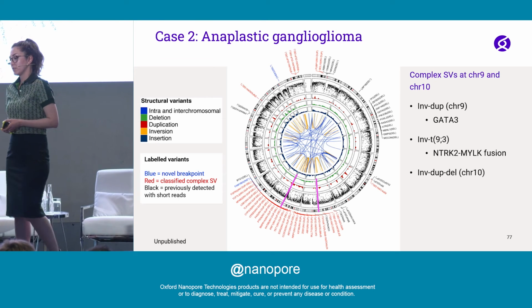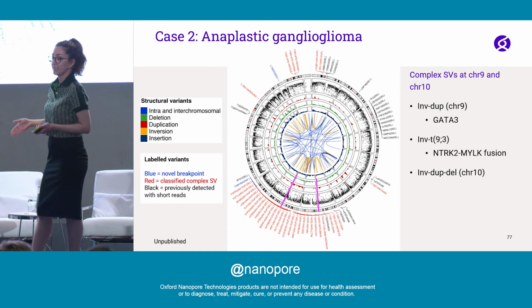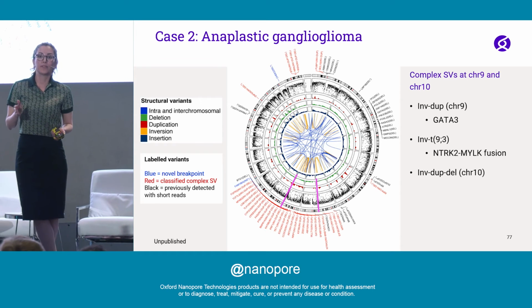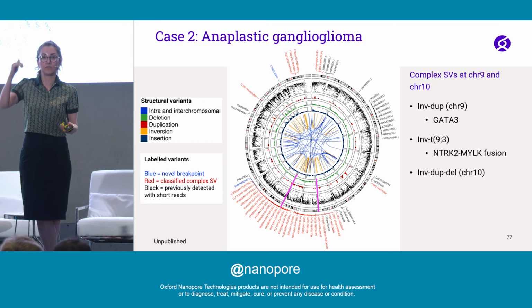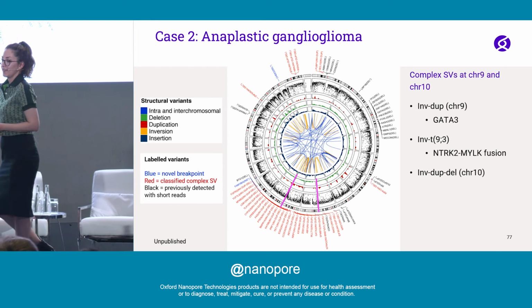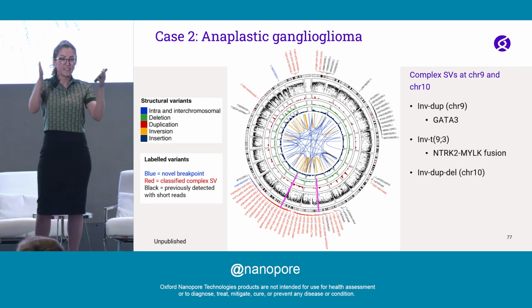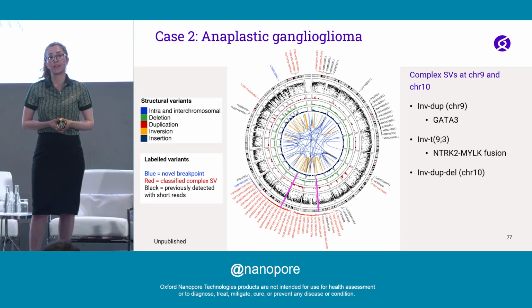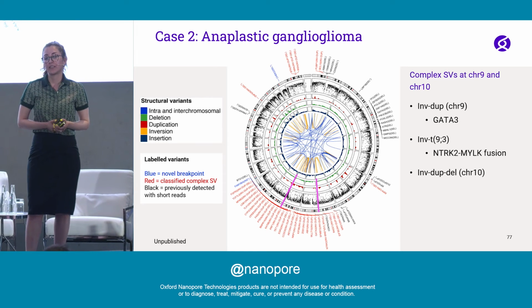In terms of chromosome 10, we identified many inverted duplicated deletions, but because there are a lot of genes involved, and it's kind of multiple links, for the exact final fusions, or the final picture, we really need to check maybe the de novo assembly or fusion genes at the RNA level.